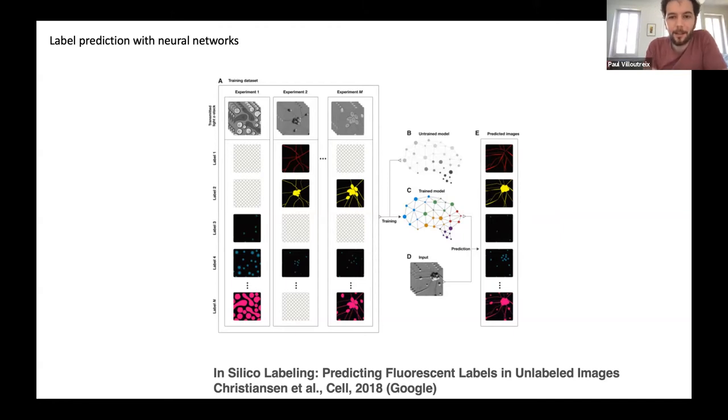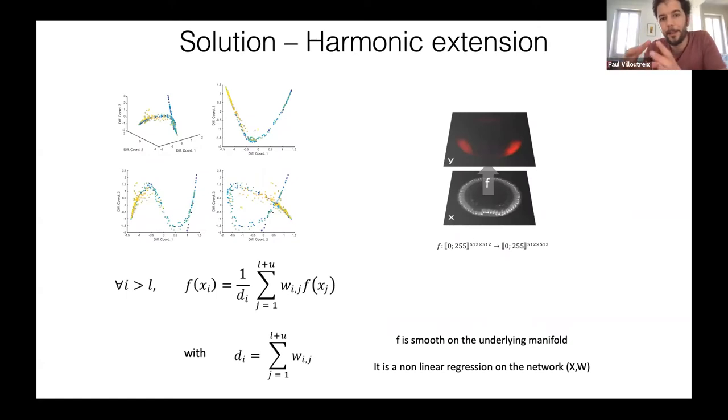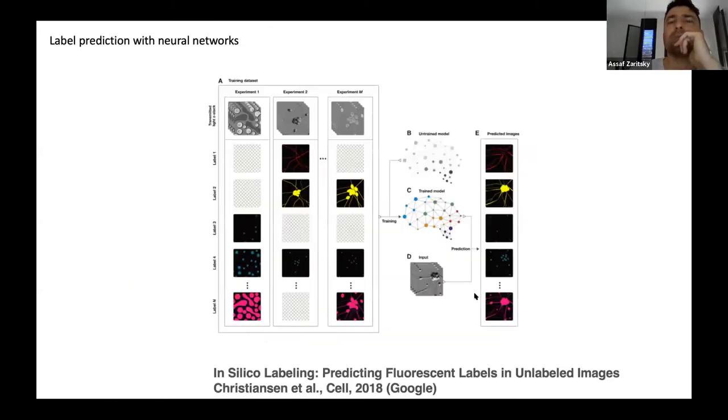I just noticed that I didn't show you, but in the end, what we got was a spatiotemporal atlas with the 7 variables that were continuous in time. Sorry, I forgot to put the movie in the slides. And this approach also works very well. The question is that you need a much larger data set to train your neural network, but it's probably a good way to go if you can combine that with transfer learning on large databases of microscopy. So again, it calls for the need of large databases to develop the best machine learning tools to combine all those images together.